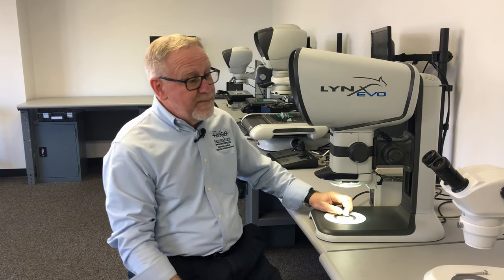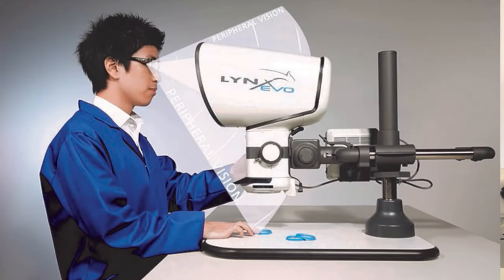The Lynx Evo is the most ergonomic stereo zoom microscope available on the market today. Unlike traditional eyepiece scopes which limit the operator's freedom of movement, the Lynx Evo lets them work in a very ergonomic working position.